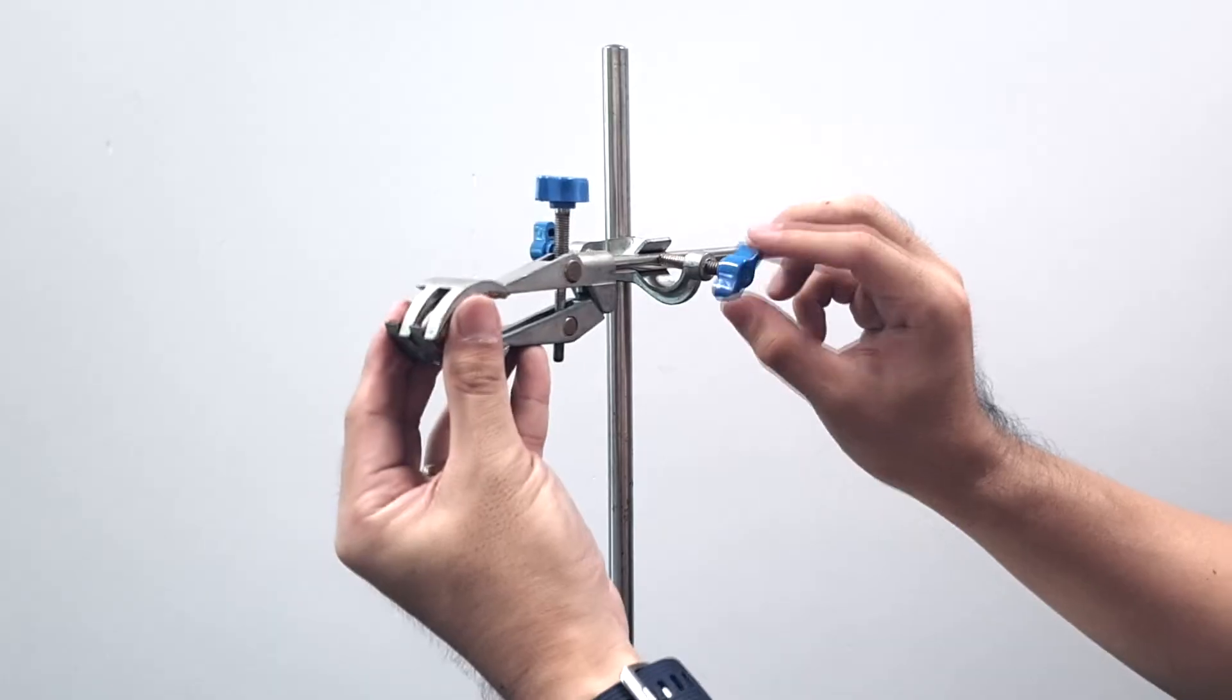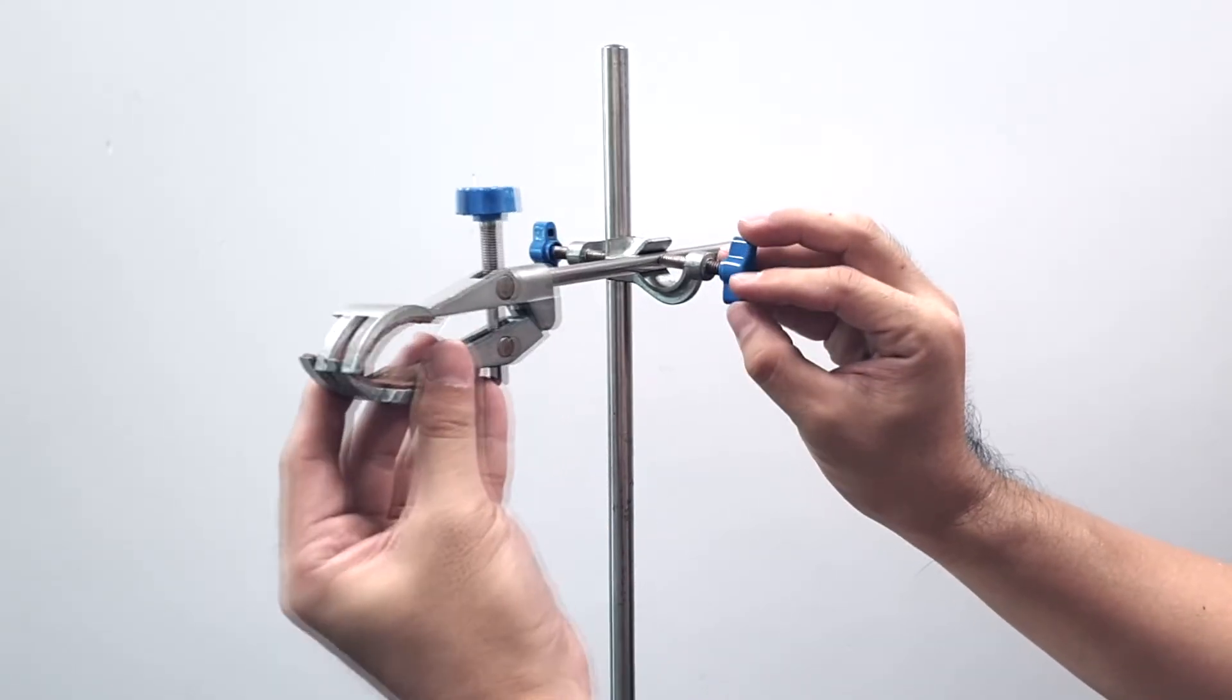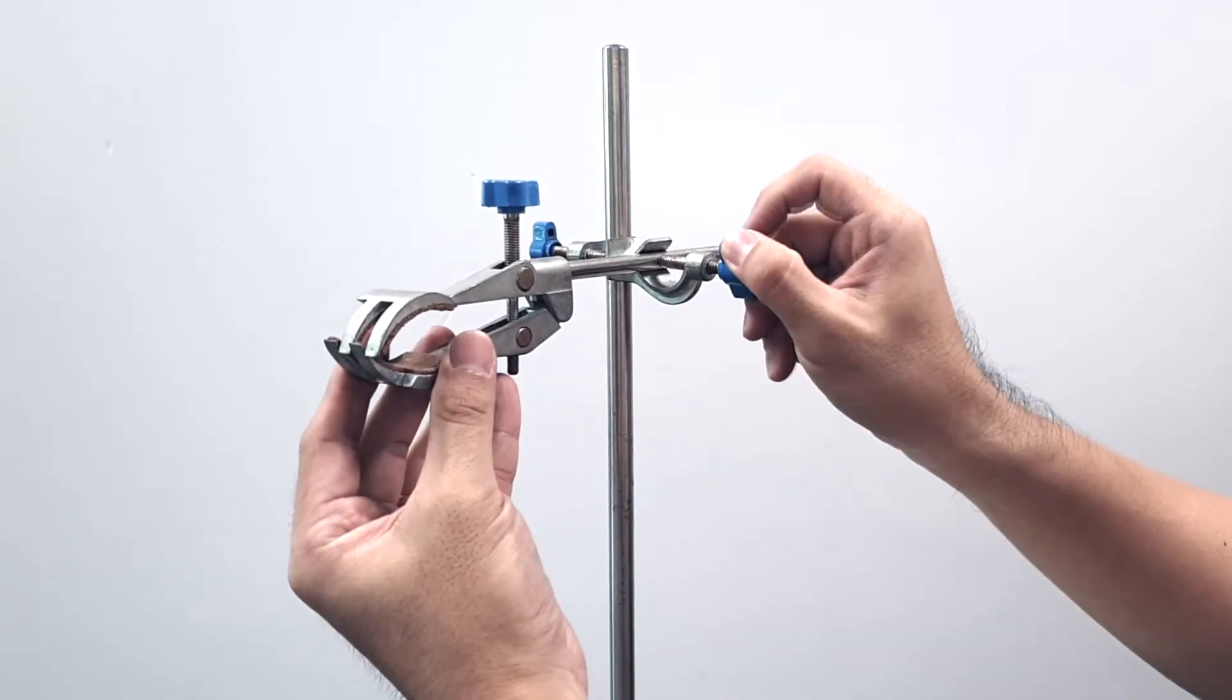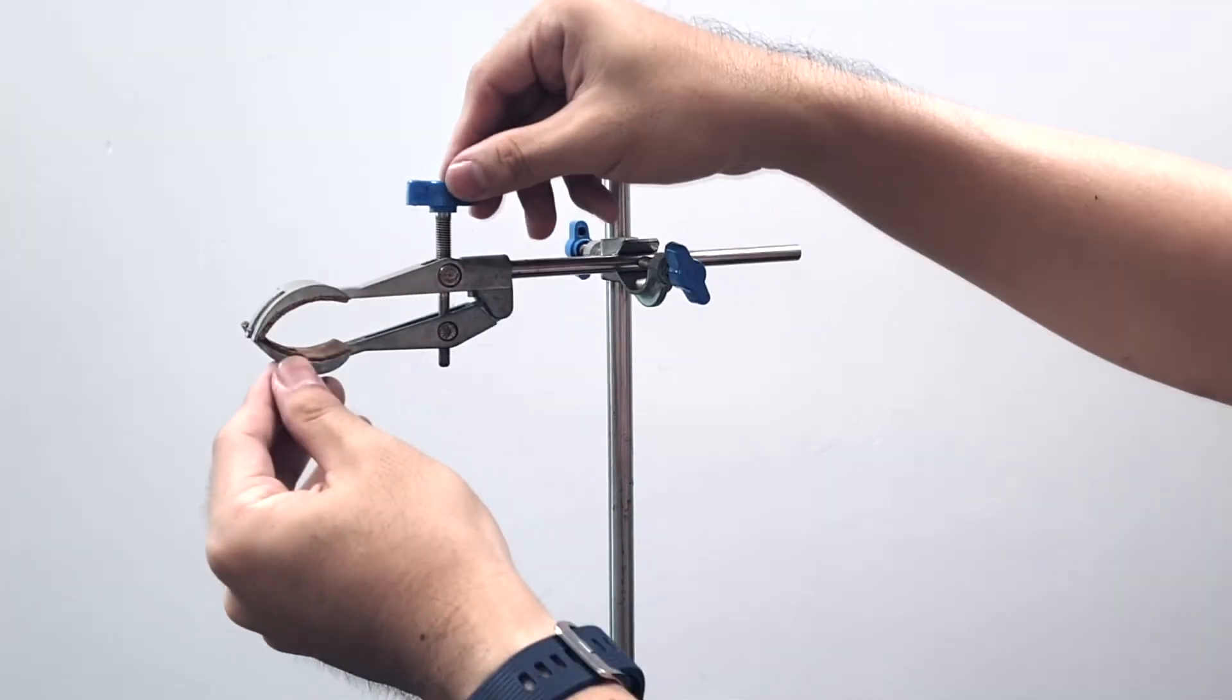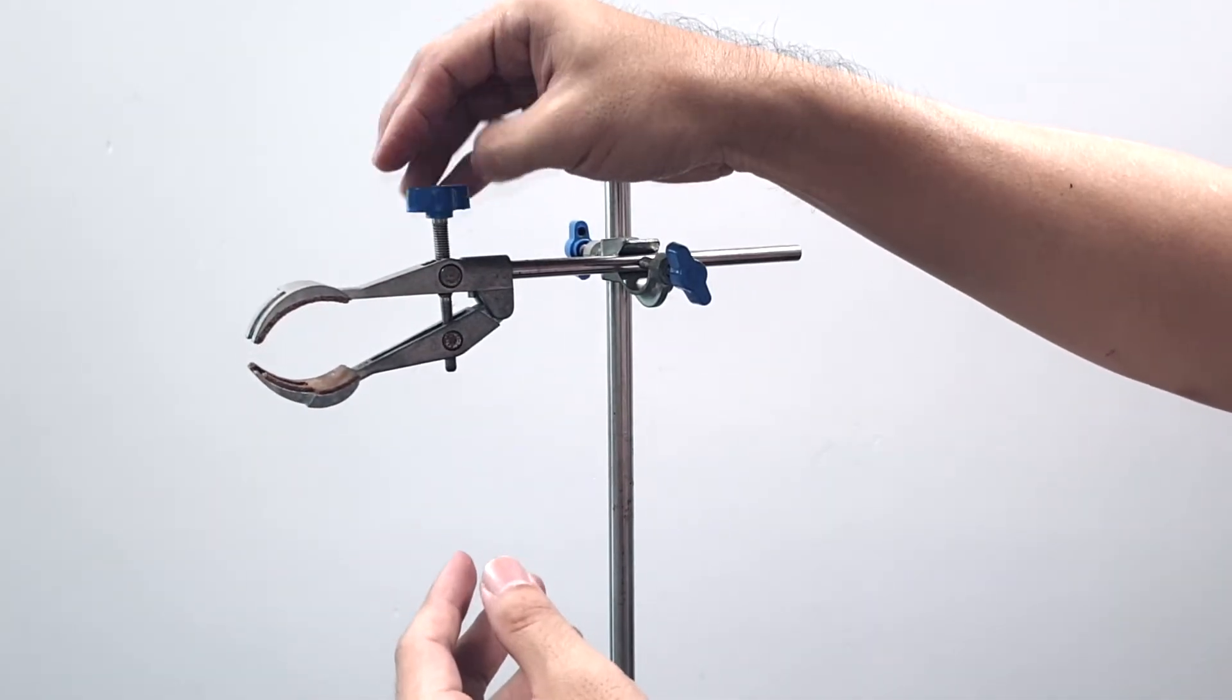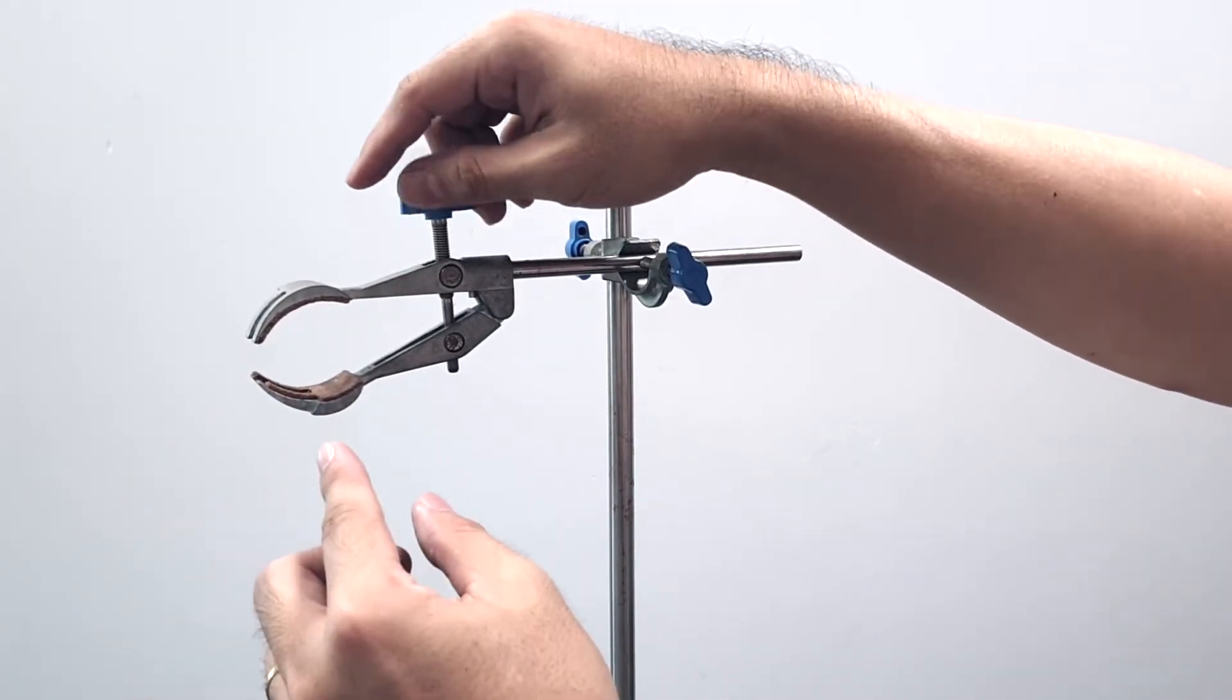You can actually adjust the length of the clamp to the desired distance according to the practical. And the top knob here allows you to open or close the jaw of the clamp.